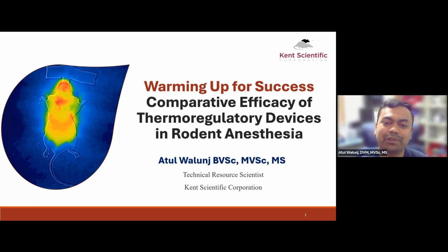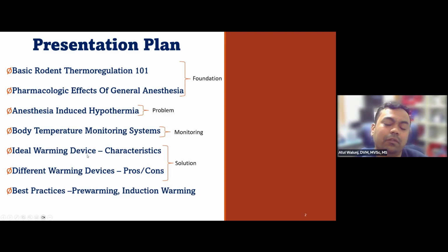Hi, everyone. Welcome to this presentation on thermoregulatory devices for supporting laboratory rodents under general anesthesia. Following are the topics that will be covered in today's presentation, starting with rodent thermoregulation 101, as well as the pharmacological effects of general anesthesia, which will be the introductory topics for today's presentation.